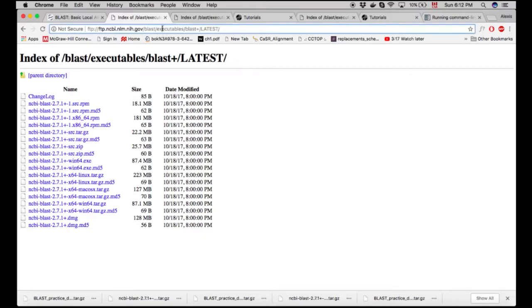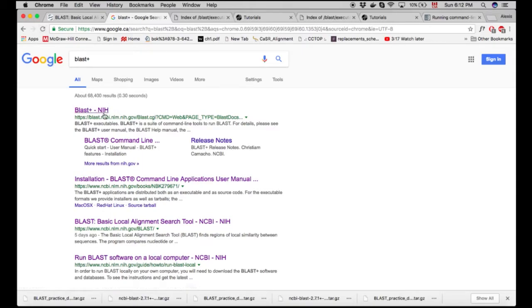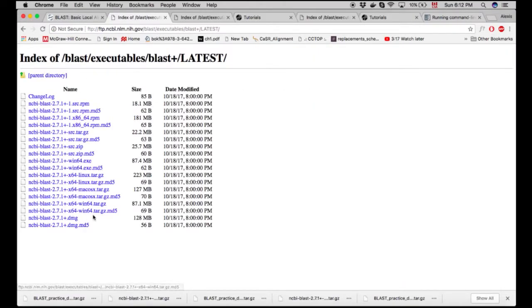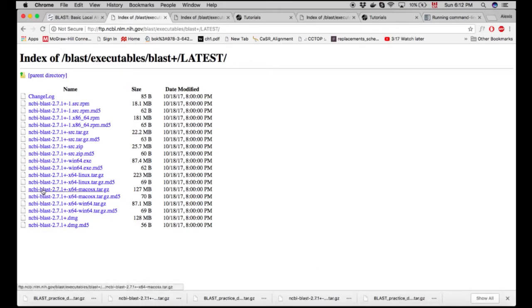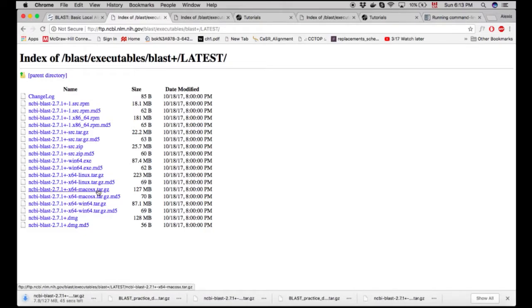To do so, just search for BLAST-Plus in your favorite web browser and click on the first result associated with the NIH. Once there, click on the first link and you'll be prompted to download the file. I'll download the macOS X tarball version. You can choose the RPM for Linux, general Linux, or the Windows version depending on your system.